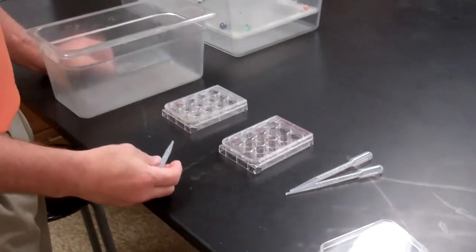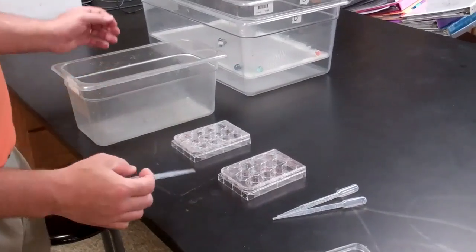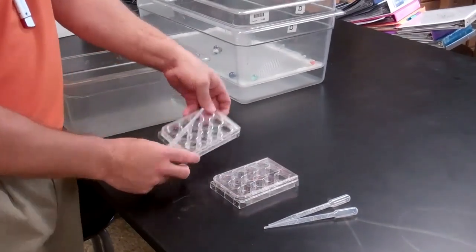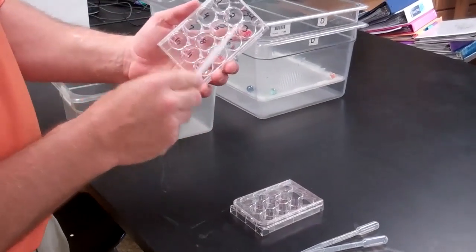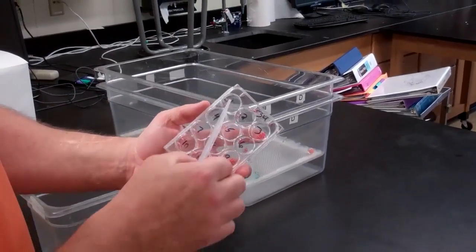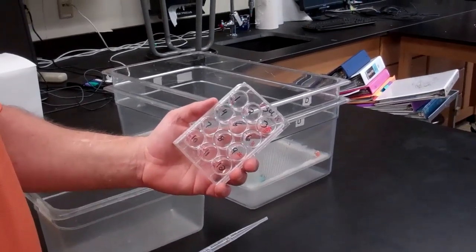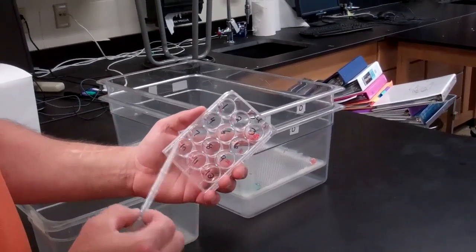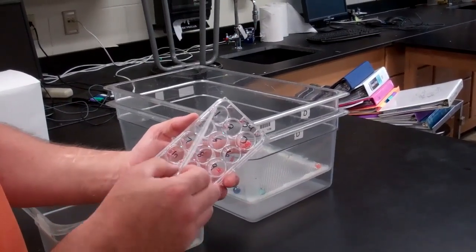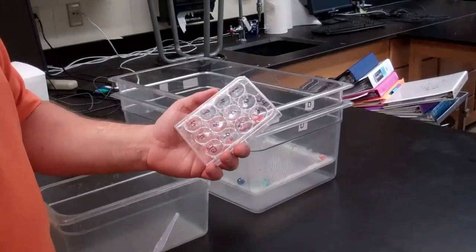Depending on if I was doing the lab right away that day, which obviously you would be because the eggs would be aging, I'd have the students number the falcon dishes, each compartment, and then I could run one or a couple of the tests based on concentrations. So I had the students label the wells of the falcon dish, and also label them according to concentration. And the students got really good at this.